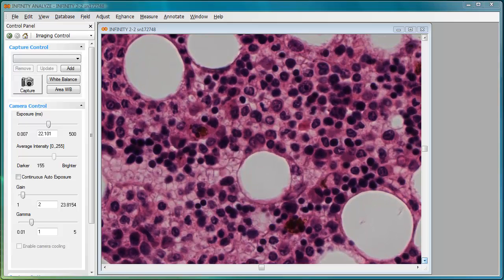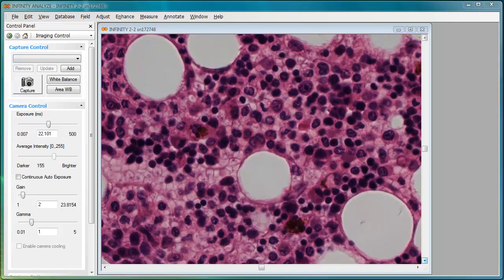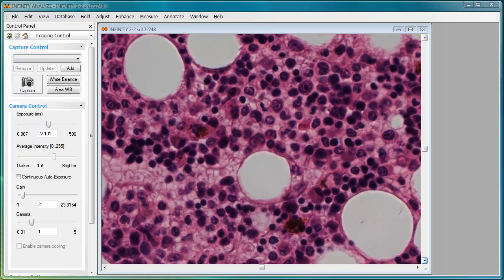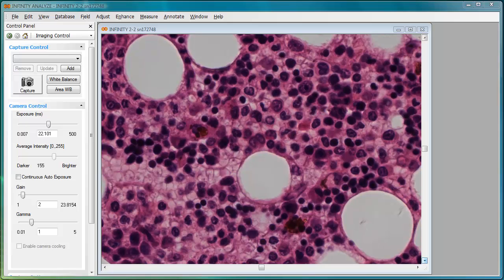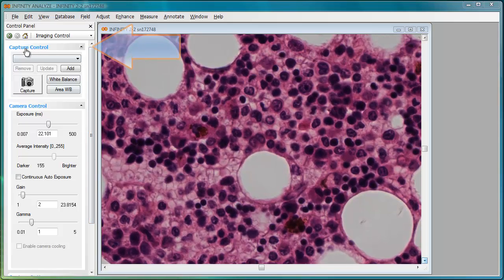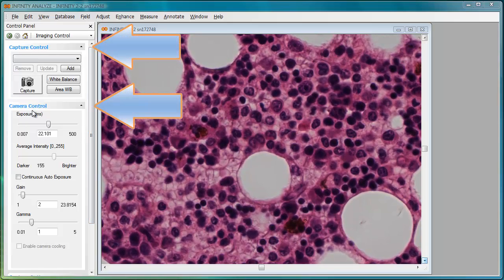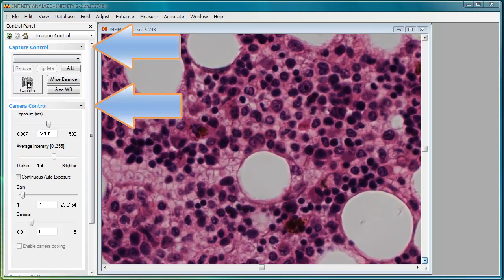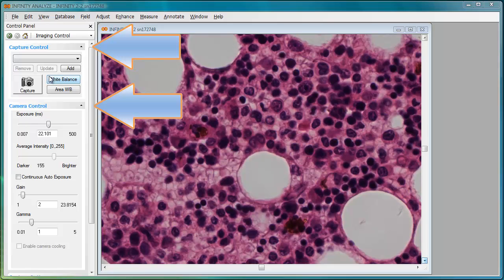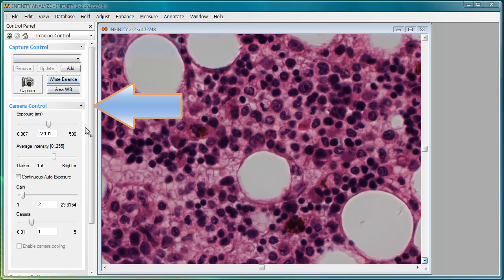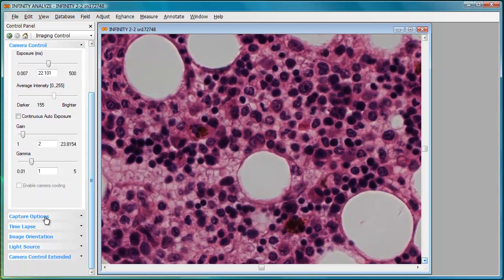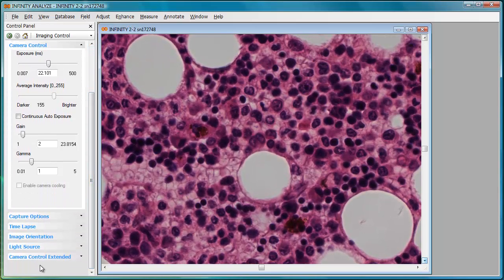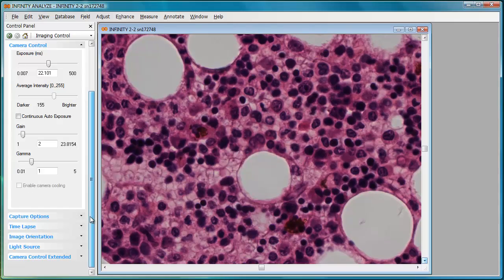You can return to simple mode whenever necessary. Simple mode is displayed currently on the screen. You'll notice that the capture control and camera control panels are exposed, while the remaining options are collapsed.